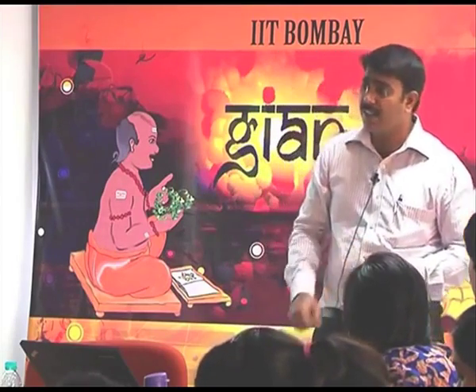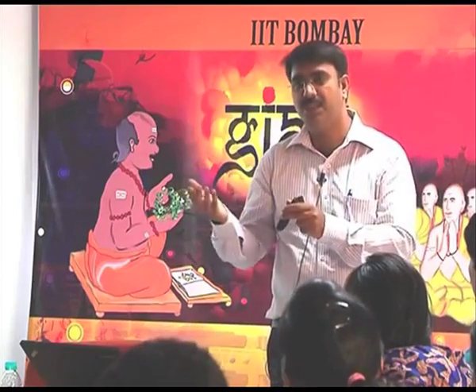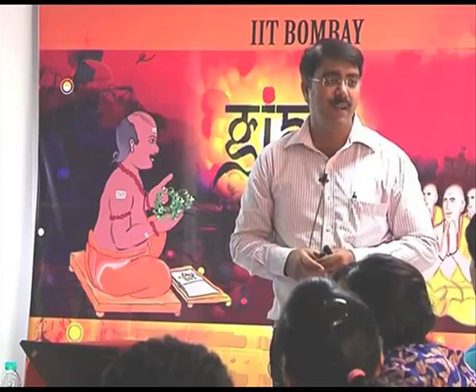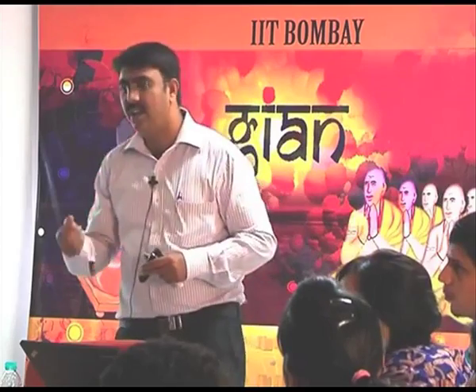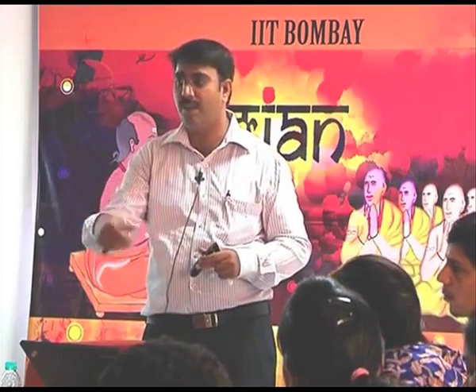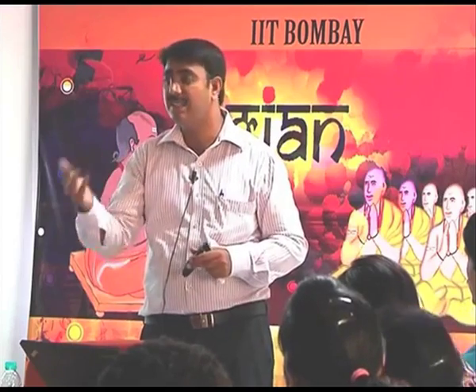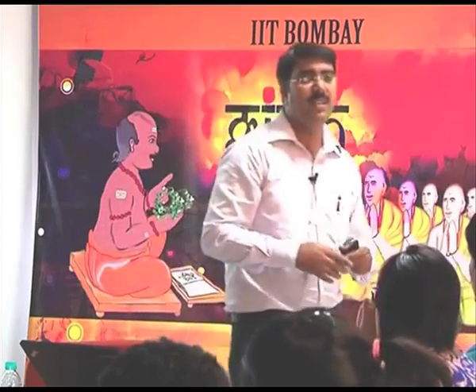Price wise, if I compare SPR sensor chips versus these biosensors, one sensor costs something like $5, and you can regenerate this sensor. Just perform the instructions, I can regenerate the surface and use it next time. At least these sensors we can use 10 times. That is the advantage.